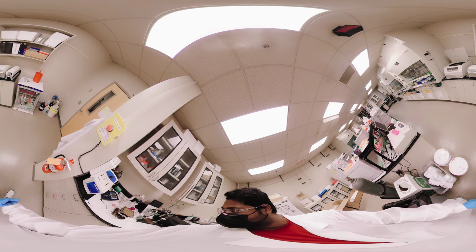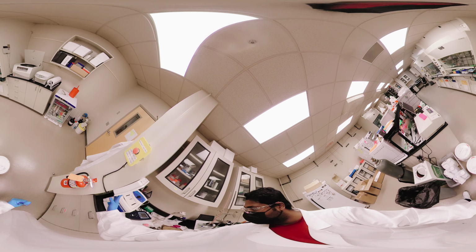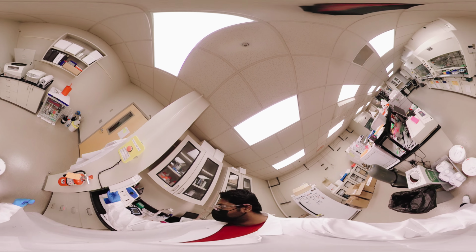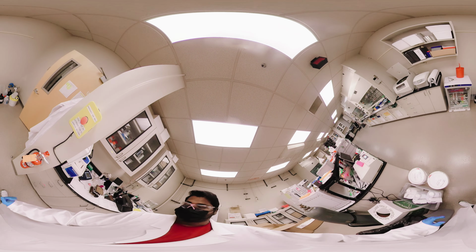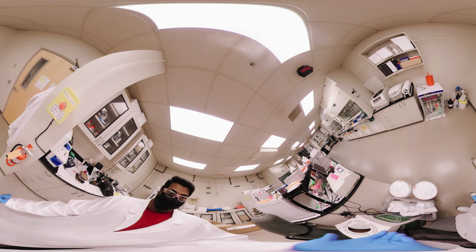We also have a first aid kit, so if you have any issue, we have all the essential things over here. We have documents over here, so you can check which chemical you are exposed to and treat accordingly.